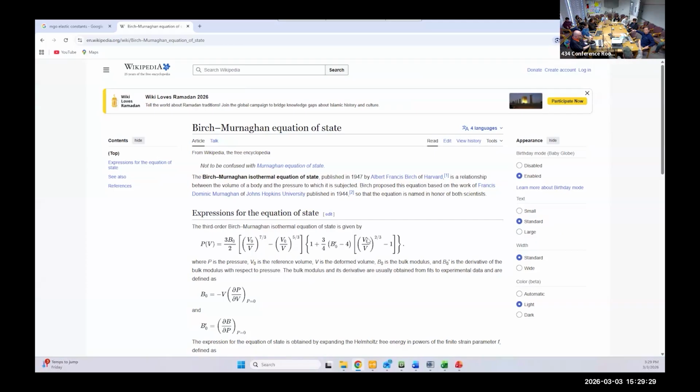From the diffraction peaks, you can get the cell parameters a, b, and c, because you know the d-spacings, and from that you can get the volume of the unit cell. When you compare the volume measured at some higher pressure to a reference, usually ambient pressure, and plug that into this equation, you can find out what the pressure is.